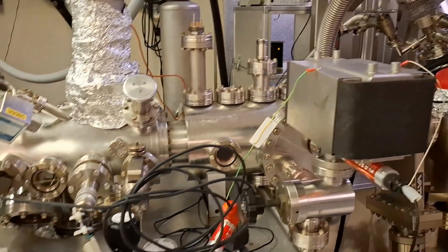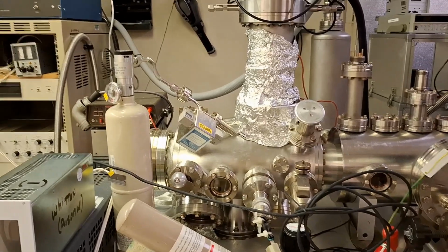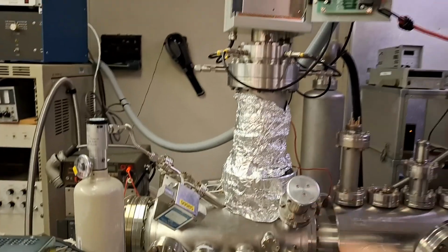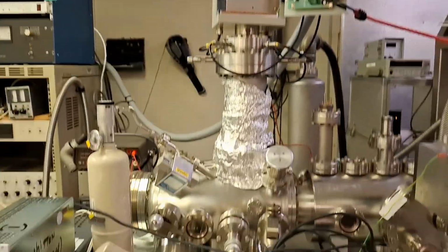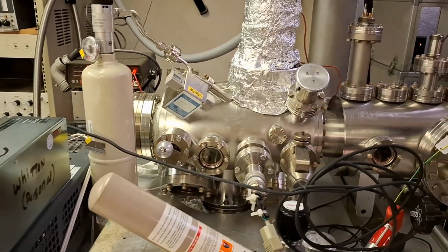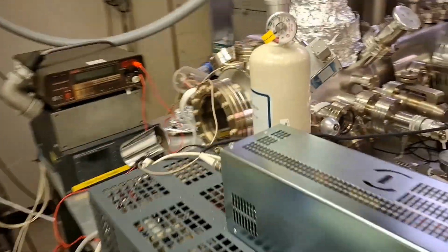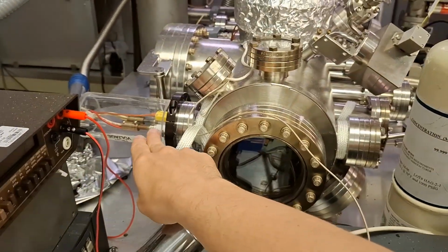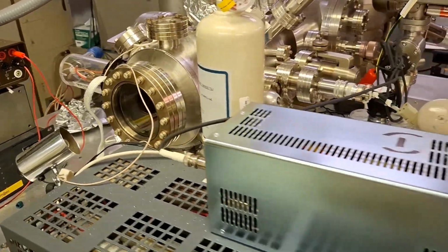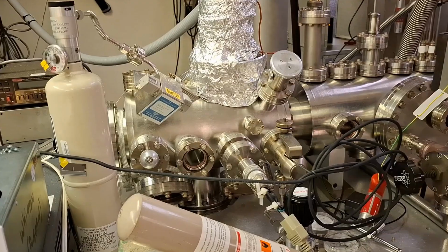And if we want to, for instance, remove the thin film, then we can go to the first chamber and we have an argon source here. We also have a quadrupole mass spectrometer. So by using the argon source, we can make argon sputtering and remove the thin film. We can also do the annealing, since we can heat the sample here, and we can completely remove the film and keep the surface very, very clean.